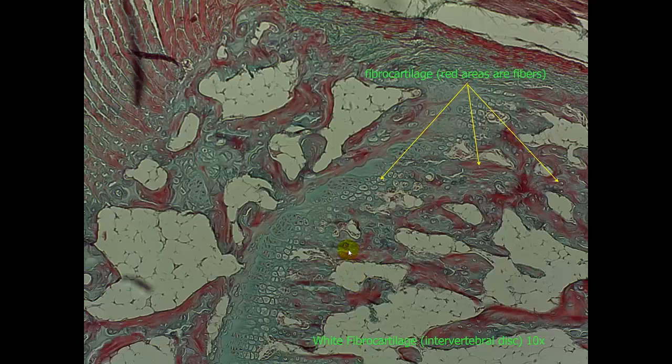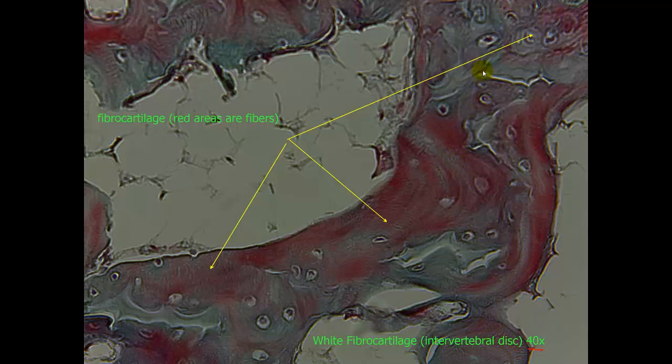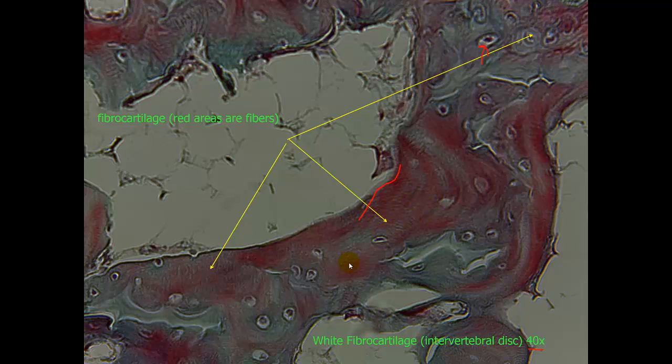Here is white fibrocartilage. Now this slide was probably stained differently than yours. We can see each of these round clear areas is a lacunae. And each of the dark stained areas is the fibers themselves. This slide is said to be differentially stained so that we can see the fibers easily. This is from an intervertebral disc at 10x magnification. Closer look. This is a 40x of the same tissue. We can clearly see the lacunae that is housing the chondrocytes. And each of these red areas are the fibers themselves. You will see a lot of fibers within the fibrocartilage. Notice that they are running in all different directions because they have to manage stress within all different directions that is placed within the intervertebral disc.